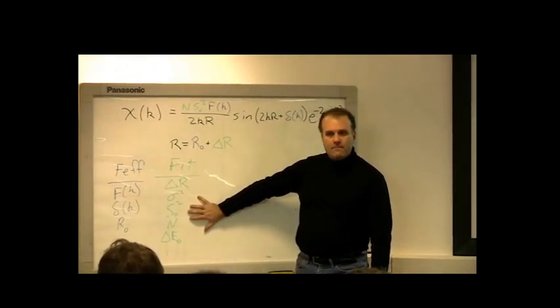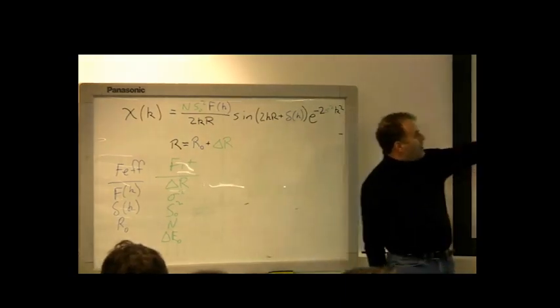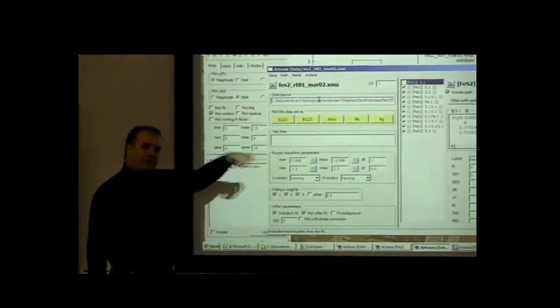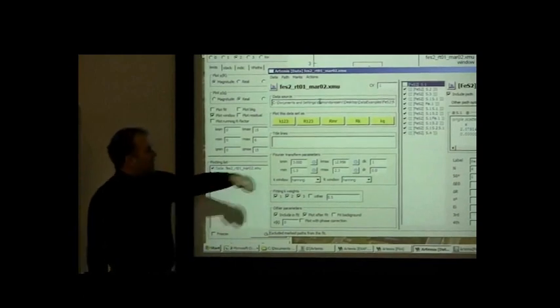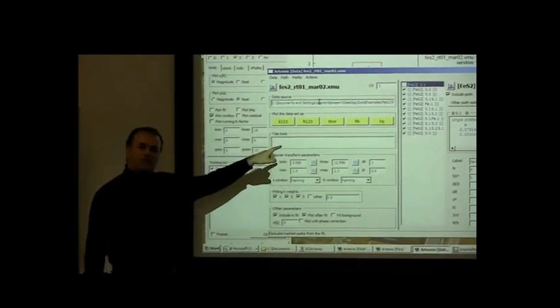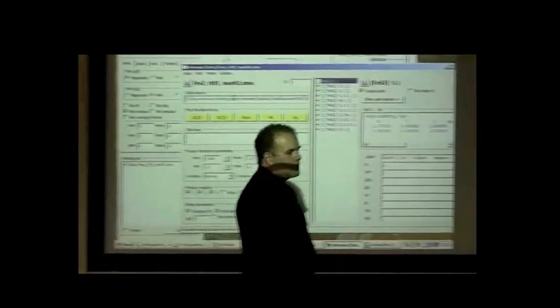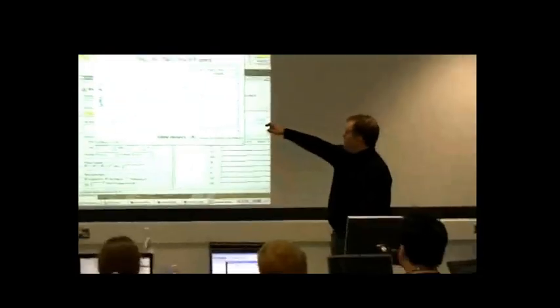That's the problem in front of us. Right now, the fit is relatively simple. It's a single scattering path, representing the contribution from the near neighbor sulfur atom that we are going to use to describe the Fourier components underneath that first peak in the data.